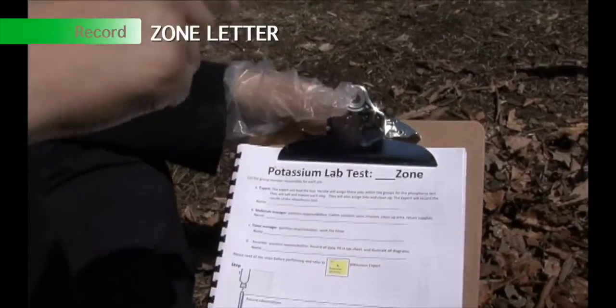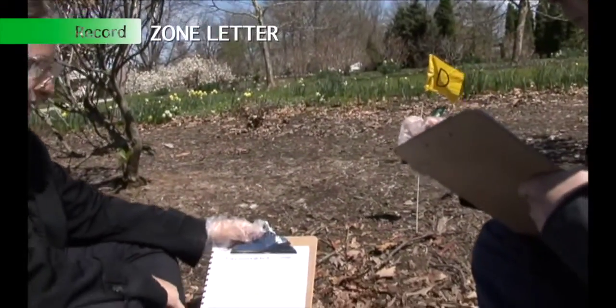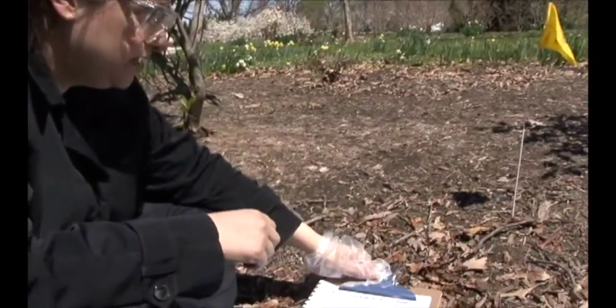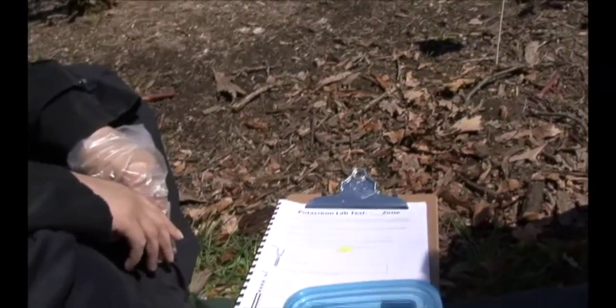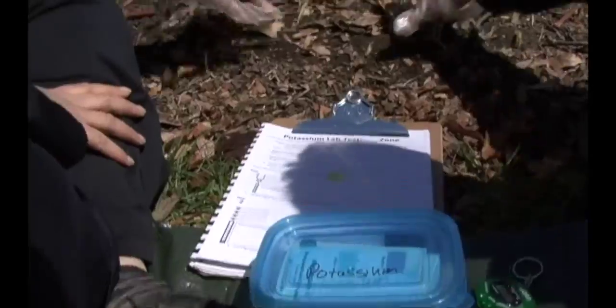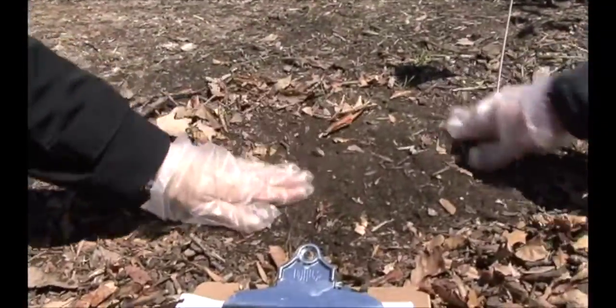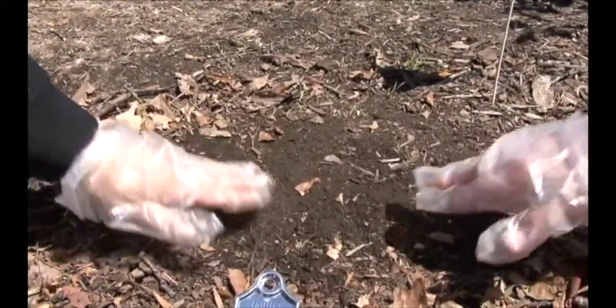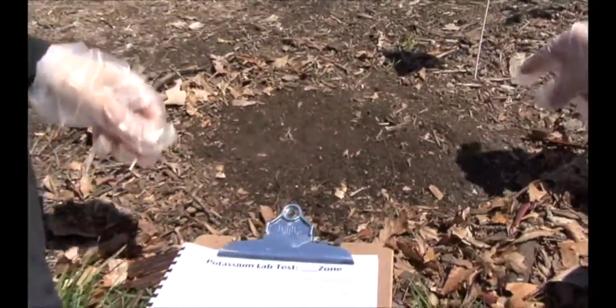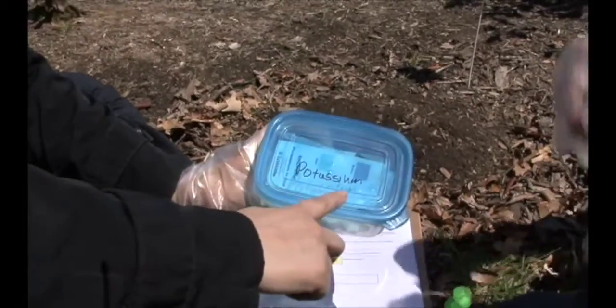Sure. I'm going to go through this step by step so you can figure out how to actually do the test itself. We're going to read the directions and follow through step by step. Okay. First, we're going to clear an area. Get rid of all the leaf litter. And then we're going to open up our potassium kit.